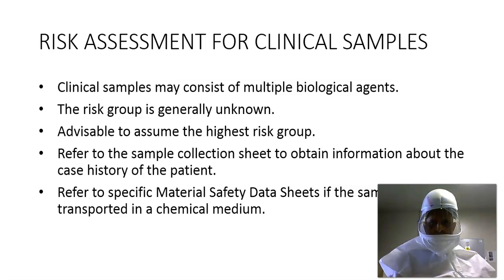In some cases, the sample may be transported or dissolved in a specific chemical or reagent. In this case, we must refer to the material safety data sheets which will accompany the samples.